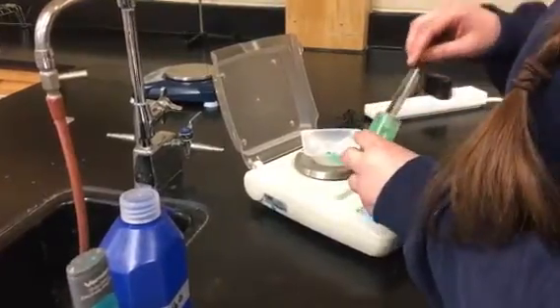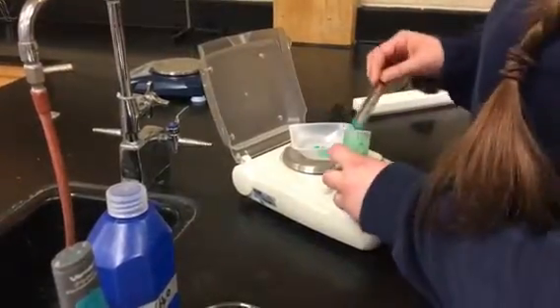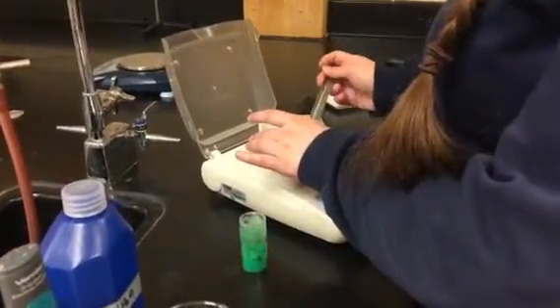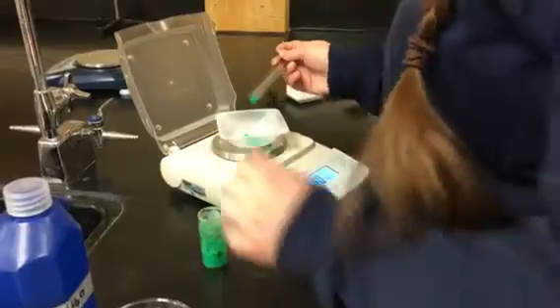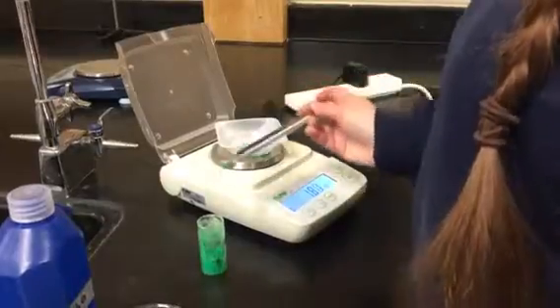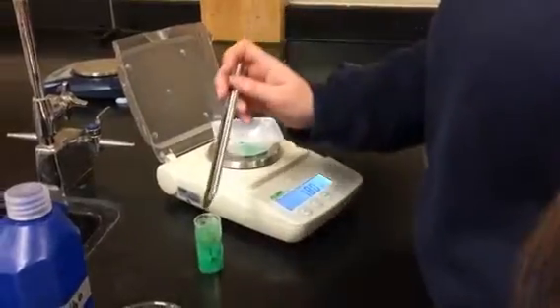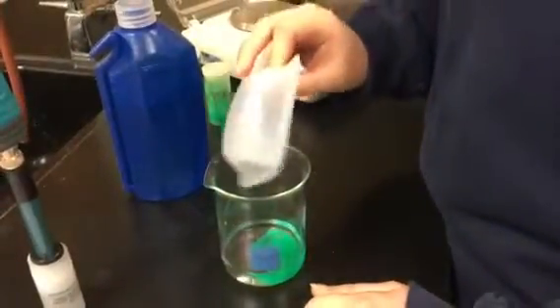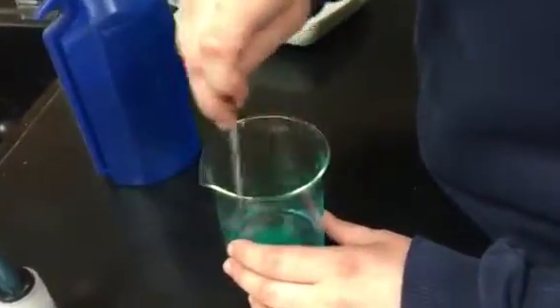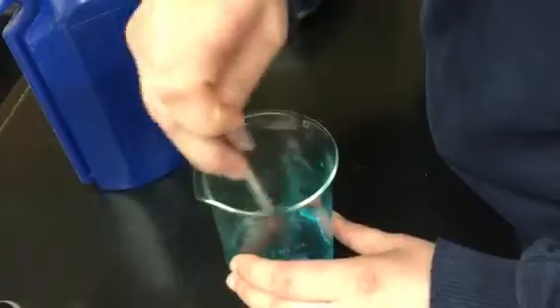After discussing between Megan, myself, and our chemistry teacher, we decided to do 5% solutions for each chloride. Also, a source, UMass Amherst, suggested that we test the pH of each chloride 5 separate times and take the average of the 5 separate times for the best data entry. Each chloride needed 50 milliliters of distilled water and 5% of each chloride, so we converted the 50 milliliters to liters, then to moles, then multiplied by the molar mass of each chloride to get the number of grams needed for each chloride to add to the 50 milliliters of distilled water to accurately test the pHs of each chloride. The chloride being tested here is copper 2 chloride.